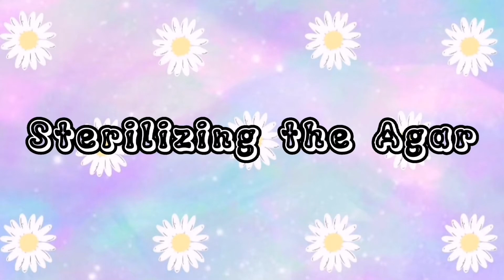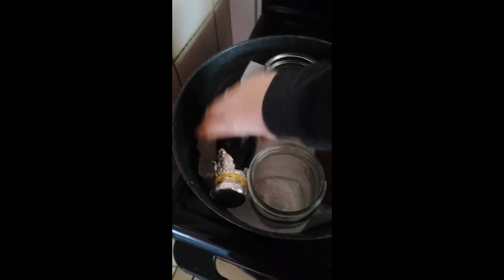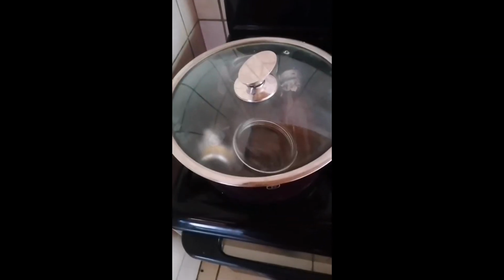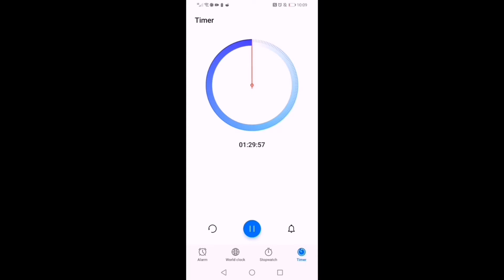And there we go. On to our next step, sterilizing the agar. So first I place some paper towels in the pot and then I place my 2 empty glass jars. This just helps to keep the agar upright so that they don't spill. And then I place in my 2 agar bottles and had to move them a bit, but then I place in some water. You can place boiling water and then I put on the lid and I set my timer for 90 minutes.